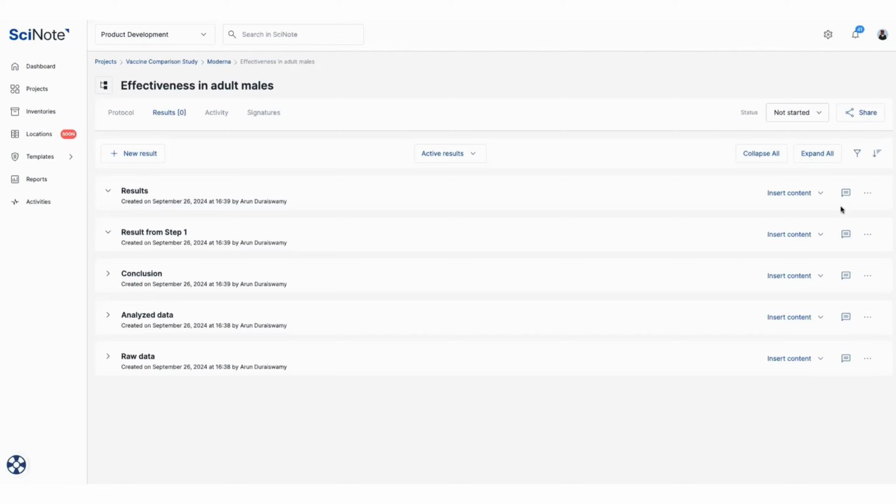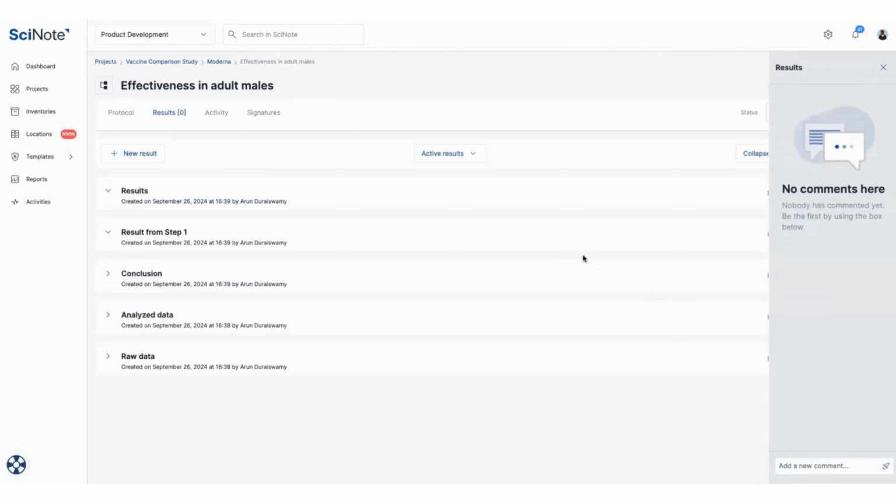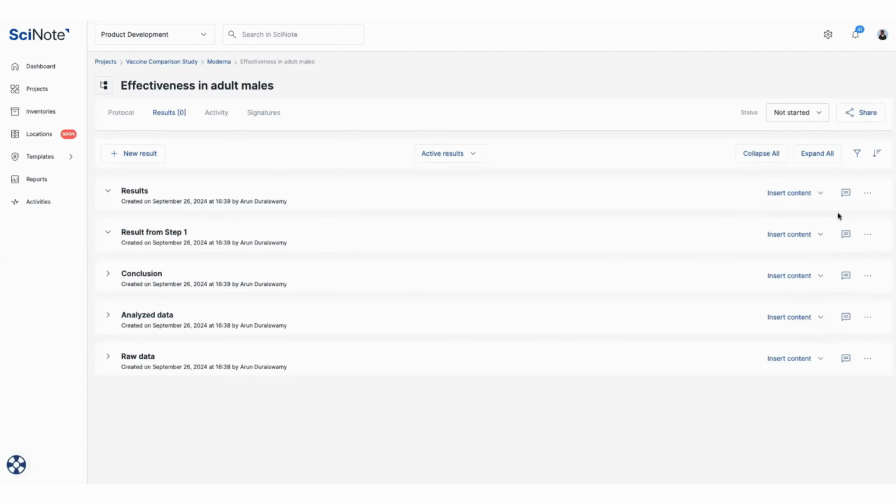And with results, of course, we have comments that you can leave in case you need someone to review the result or something doesn't look right. You have the ability to tag users in the comment section here. And once again, the comment section is preserved, so you can always refer back to it in case there's some important information there. Okay, so next we'll take a look at the activity log.